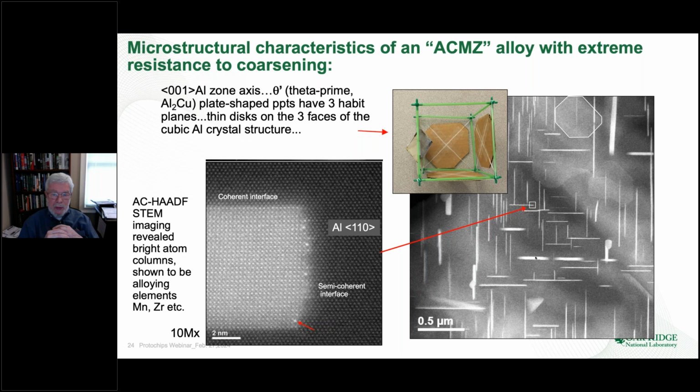Tungsten doesn't move in aluminum at the temperatures that we're interested in doing studies on. So I want to show just an example of the kind of results that you can get with the good technology for making samples.